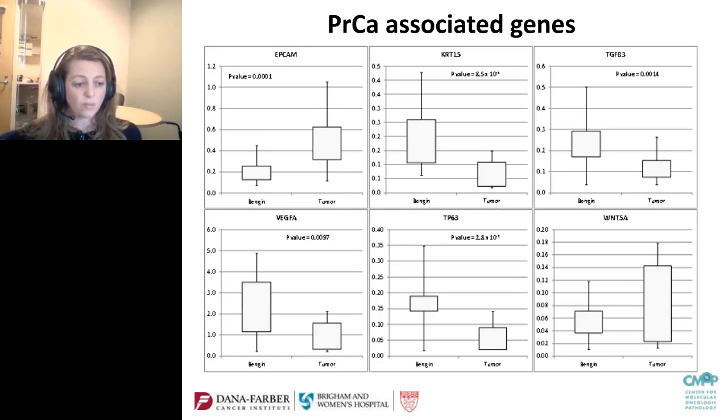Another aspect of all of this, as I said, was that we wanted to look at all the sequencing data and see if there were methods in which we could interpret, first of all, what's lost relative to our fresh frozen counterparts. We have fresh frozen samples for which RNA-Seq libraries were also prepared and sequenced. So we have that data as a benchmark, and we want to compare this FFPE data to that to see what's being lost through degradation for these samples, and whether there are any algorithms that could predict what you should expect based on degradation level.